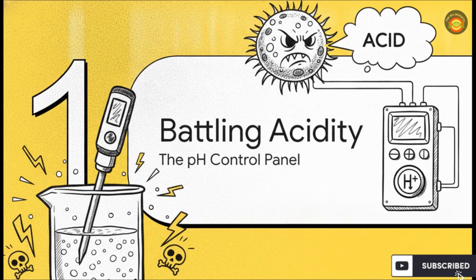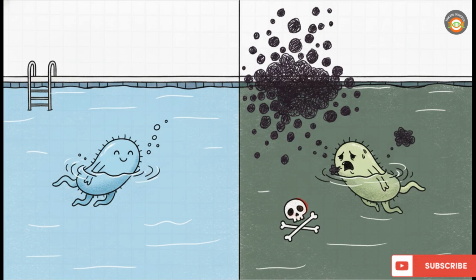All right, let's start with system check number 1, battling the acidity problem with the pH control panel. The biggest, most immediate danger to our microbial workers is actually themselves. The thing is, these microbes are incredibly messy. As they gobble up nutrients and pump out the metabolites we want, they naturally generate acid as a waste product. If we just leave that unchecked, the environment inside the tank becomes toxic really fast.